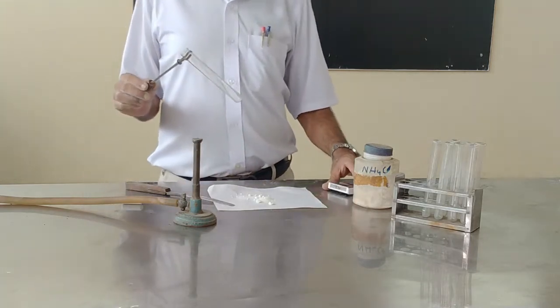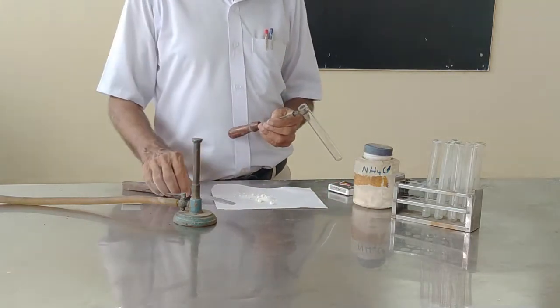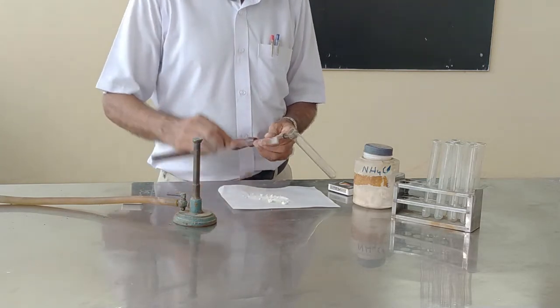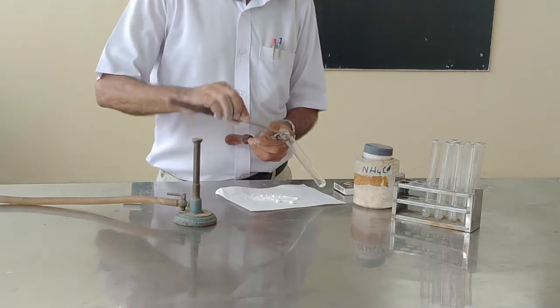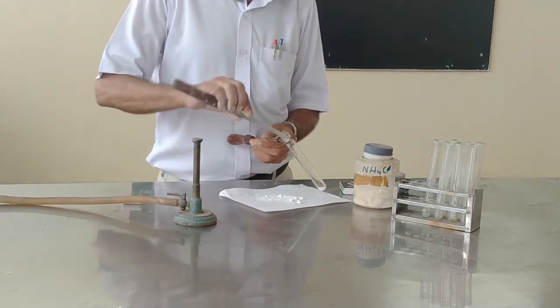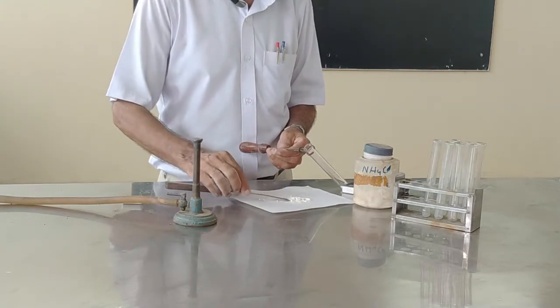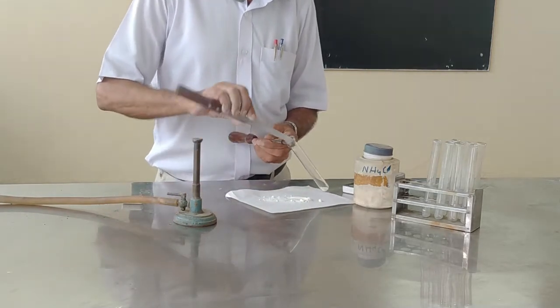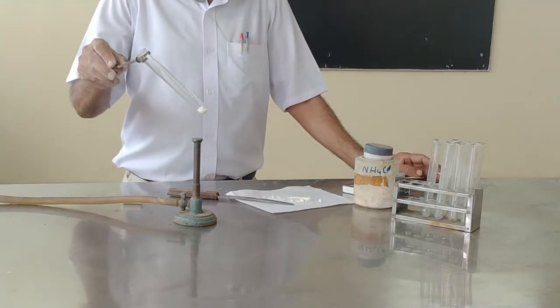Spatula and matchbox. In this process, first we have taken ammonium chloride in the test tube, which is solid in form. Now heat this ammonium chloride in the test tube on the burner directly.